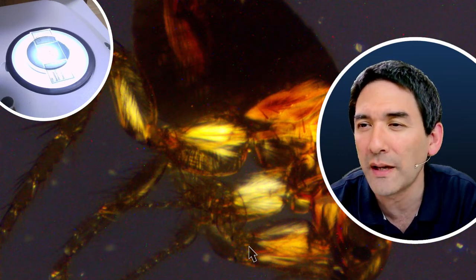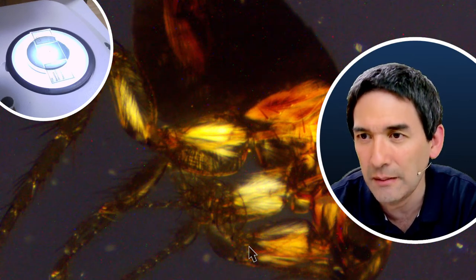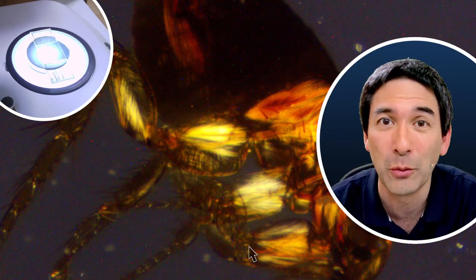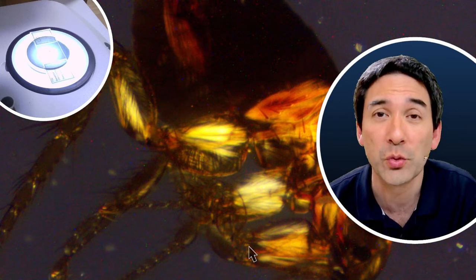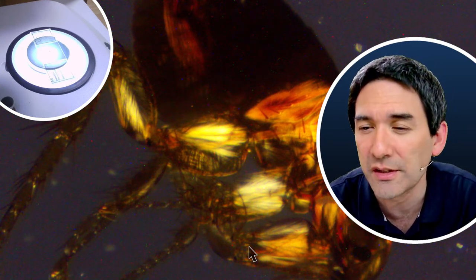Would these polarized lenses be good for mineral specimens? Yes, minerals are often crystalline, and therefore, of course, they might be optically active, and as a matter of fact, that's why you have so-called polarization microscopes, which are used by mineralogists to actually observe minerals and crystals.